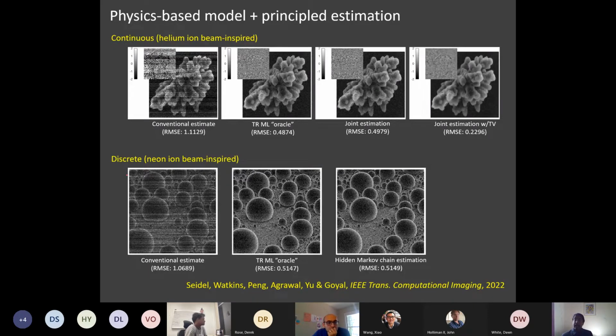So our physics-based probabilistic modeling shows that the beam current lambda and the SE yield eta can be estimated from the same data when that data is time resolved, in the sense that I've been discussing here. If we didn't have time resolved data, this would be like I have one scalar value per pixel, and I somehow want to get both lambda and eta at that one pixel. It would be like estimating both factors of a product from one number, which sounds extremely hard. Maybe it's possible because of correlation of pixels, et cetera, but I don't want to claim that kind of crazy magic. It's not that, but because we have time resolved data at each pixel, it actually becomes plausible.